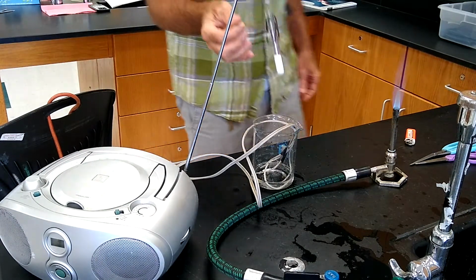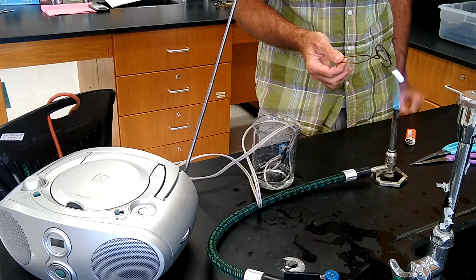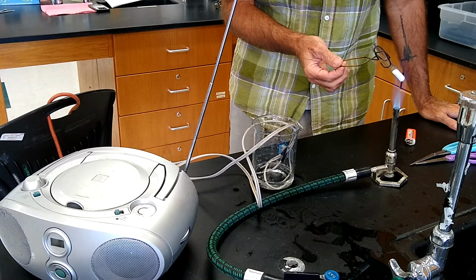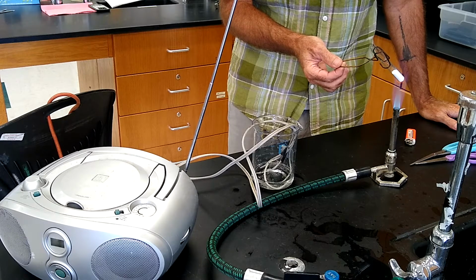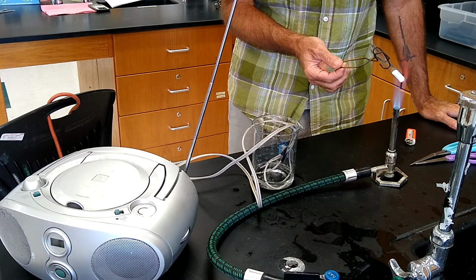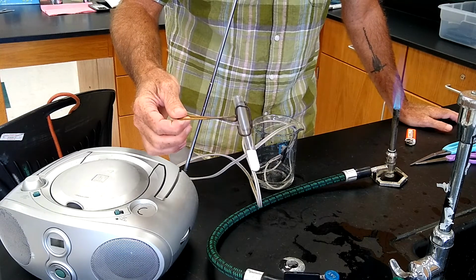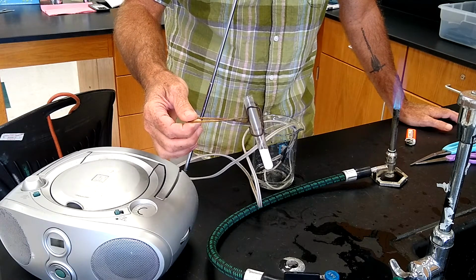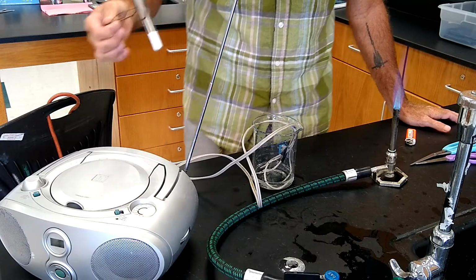All right, here we go. I'm going to take this white powder and put it on this flame. All right, we're waiting. This substance is not melting. So question number one, is this powder an ionic or covalently bonded compound? That's question number one. Okay, obviously it's ionic, it didn't melt.